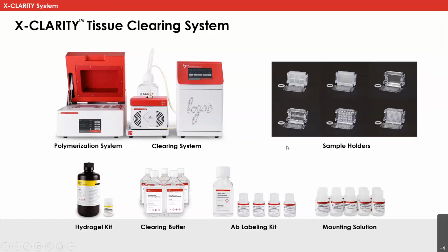The other part of the system are the reagents. And so we have the hydrogel kit, the clearing buffer, which essentially is SDS. Then we have also what's known as the deep label antibody kit. This will help speed up antibody labeling and make things more specific. And then we also have our version of refractive index matching solution, what we call the mounting solution.